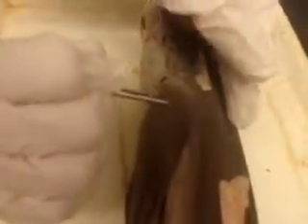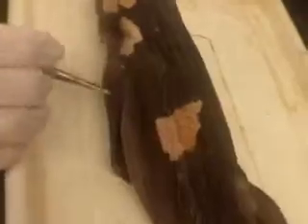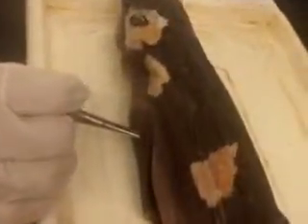And then we have the pectoral abductor or extensor. Now, we didn't remove the skin, but here's where the pectoral abductor or extensor would go. It originates in the scapular process of the pectoral girdle, and it inserts in the pterygophores. And it is homologous to six muscles in the necturus, which I have listed right here. They are the triceps brachii, the dorsalis scapulae, the procoracohumeralis, the latissimus dorsi, the forearm extensors, and the supracoracoideus.